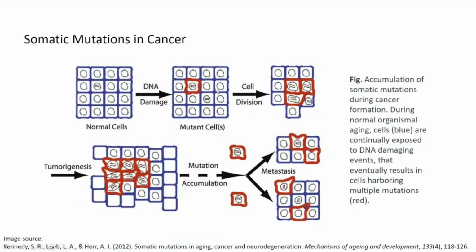So cancer, I think generally we can put into two categories. One is the inherited cancers. The parents might carry some mutations and then pass them to the next generation or offspring, and the offspring also carry some mutations that will end up with cancers. If we are looking at inherited cancers, most of the time we are looking at the germline variants. But I think most of the cancer cases are categorized under somatic cancer.